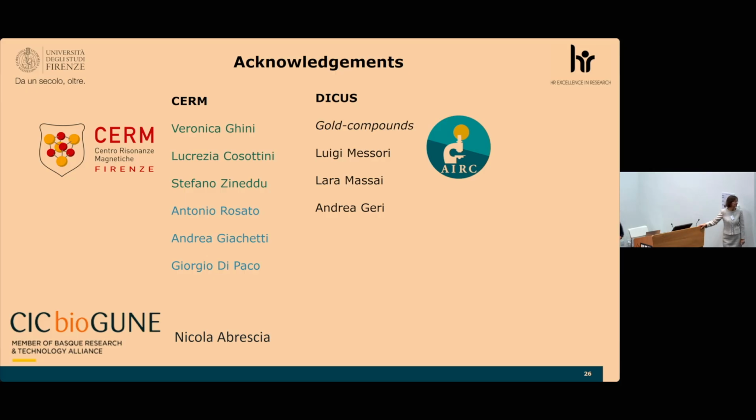It was a really nice talk. So when you take your ferritin, if you label it with the methyl groups in a deuterated background, how does the spectrum look? Is that something you could potentially use? Deuterated background, not for proton NMR.